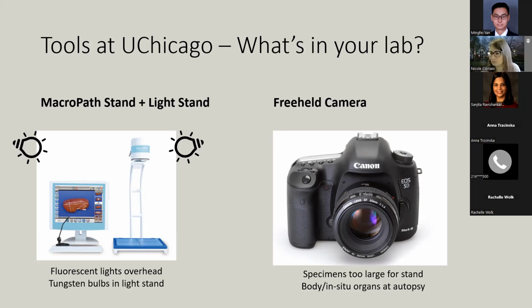We've had some people demonstrate an interest in photo stands, but then it tends to be a little controversial. One, because of space, which is a bit of an issue for us. And then the other issue that sometimes people have is you have multiple people who might need to use it. And so you might have to wait in line, and then you have to transport the specimen over, and it might take you some time to rearrange it or whatever. I mean, I see both sides of it.